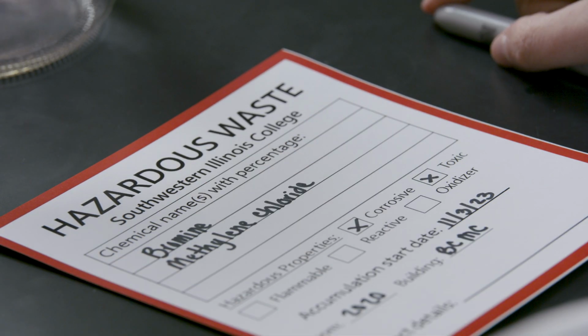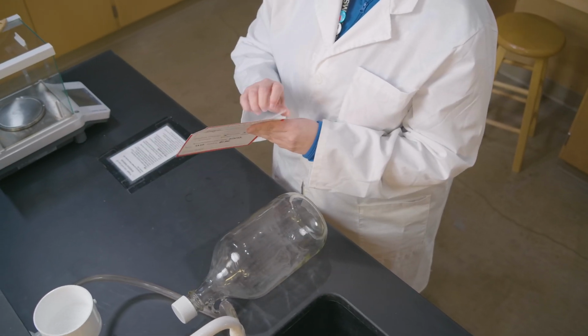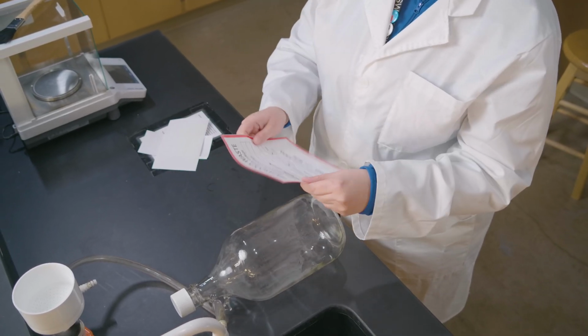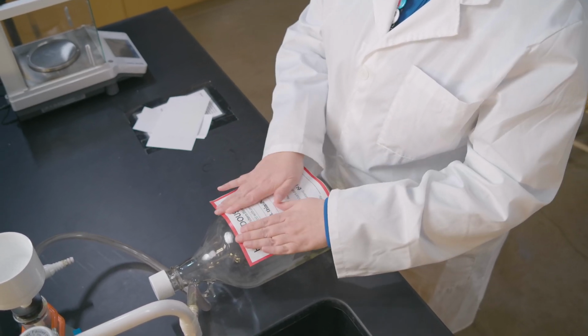And one more thing. Always make sure the lids are firmly in place when you're not collecting waste. We don't want any unwanted spills or leaks. And remember, store these containers in well-ventilated areas to prevent any buildup of fumes or hazardous conditions.